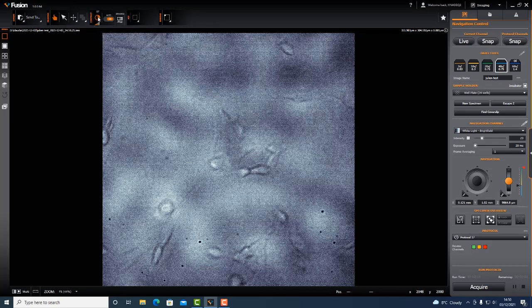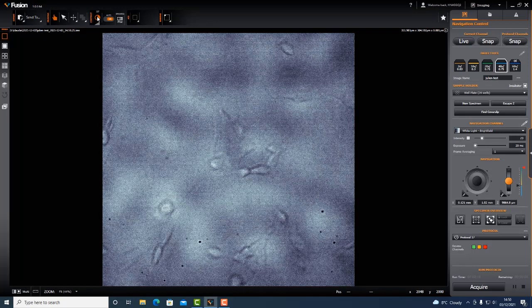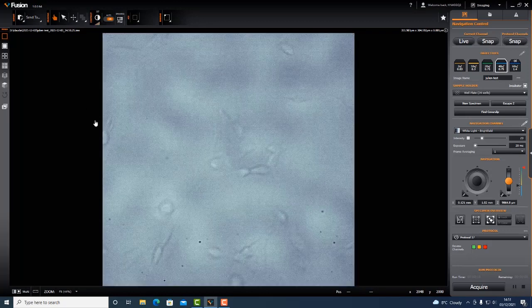And I can basically repetitively click this, and what it does is it changes the contrast of my image. So there you see it's just jumped. We start at 99 to 1, and each time we click it, it's changing the contrast. Depending on your image, you'll see more or less effect the more you click this. There's 10 iterations in total, and then you can go back to a starting point. So that's the contrast tools.